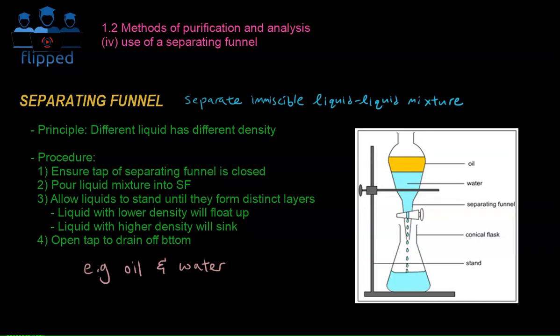So today we are on the usage of a separating funnel. Unlike chapters such as evaporation, distillation, and crystallization, these are names of processes, am I right? But in this case, this is not a name for a process. This is just a usage of an apparatus. So this is an apparatus name. We cannot name it, for example, like separation, because it'd be too vague. So that's why they just leave it as the usage of separating funnel. Hopefully that's clear. But it's still a process basically.